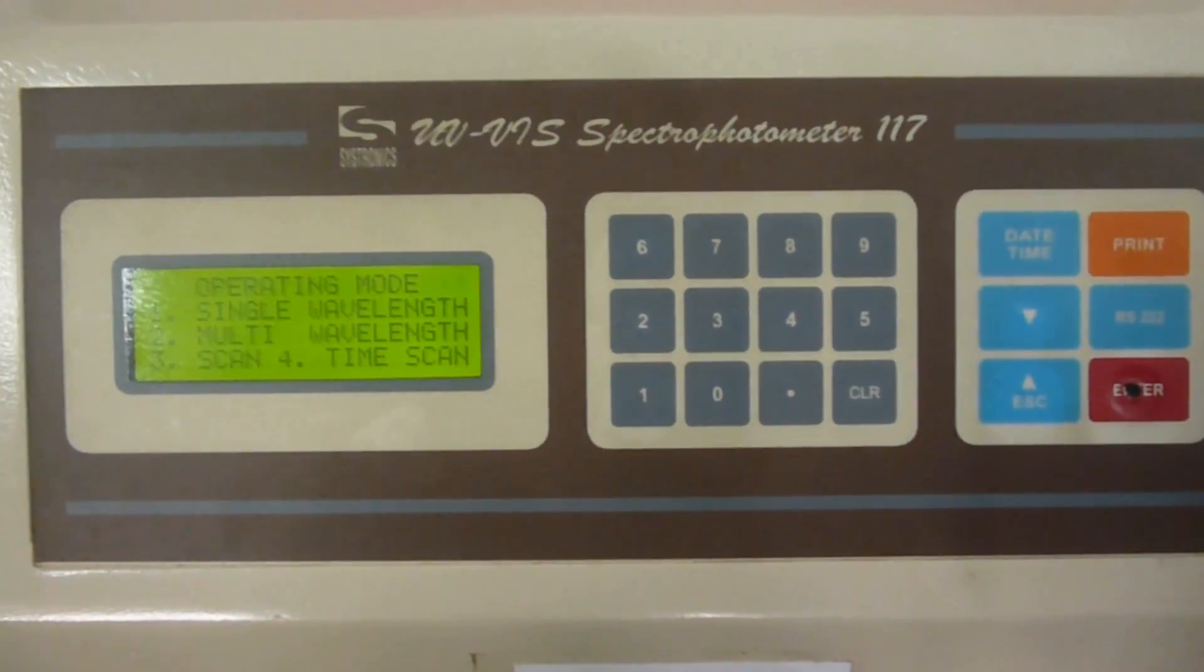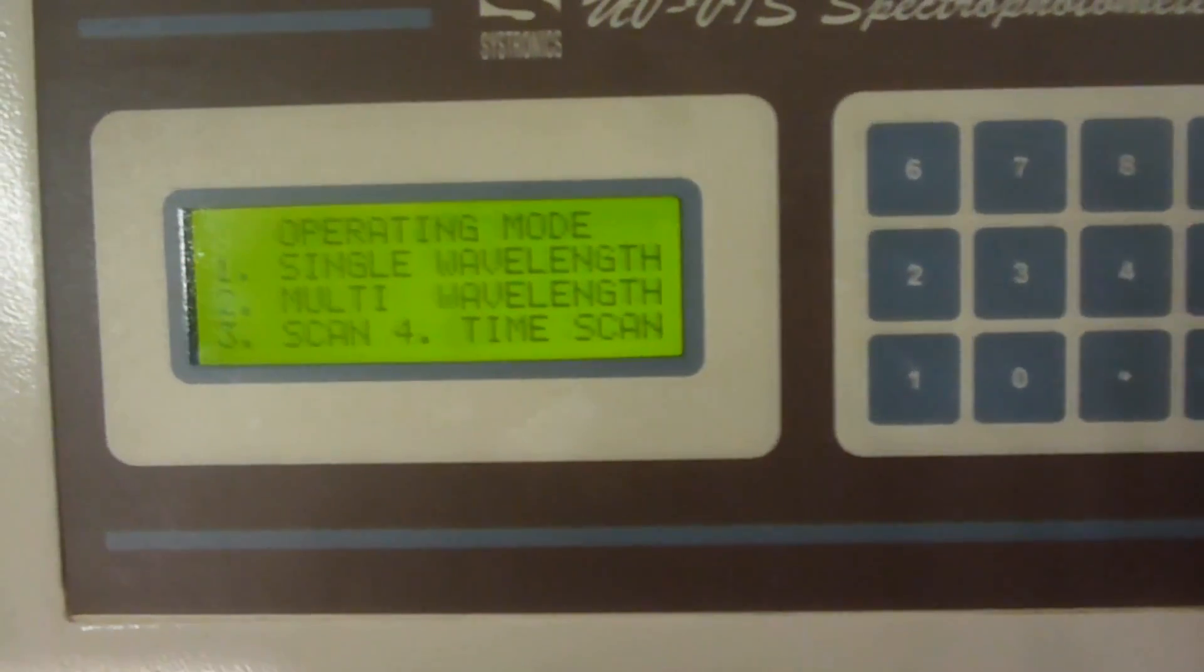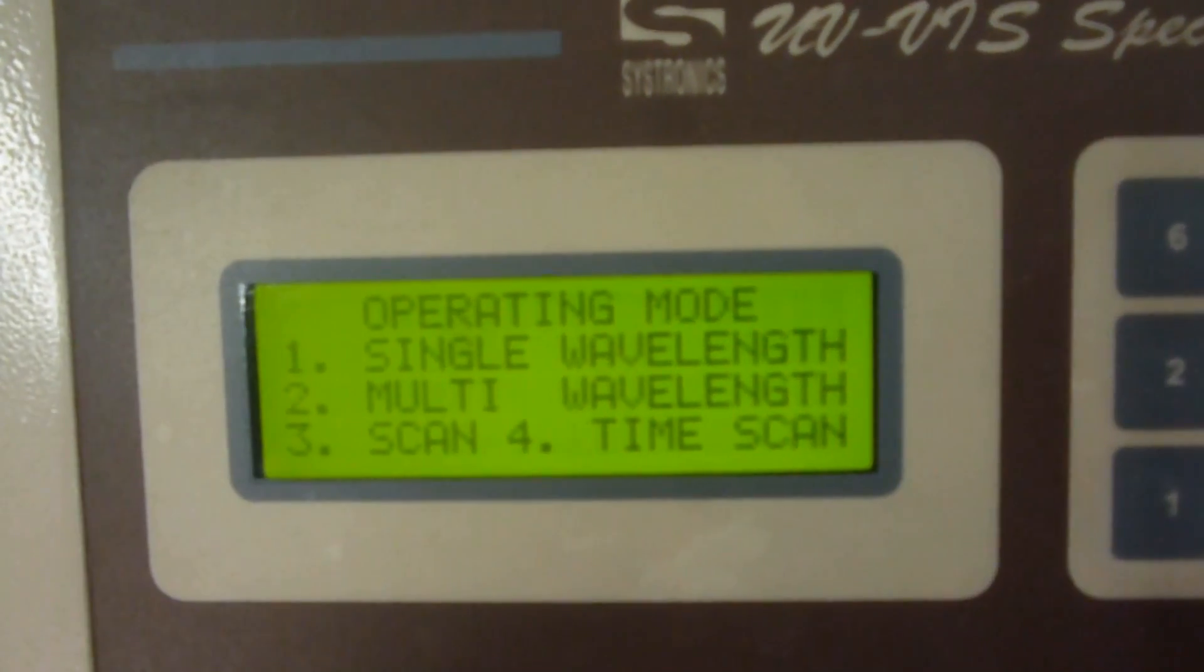Meanwhile, turn on the spectrophotometer and set the light wavelength of 660nm.